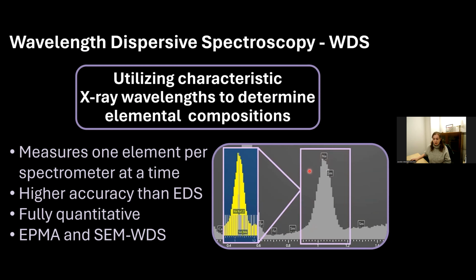So this is from a standards plot that I was analysing back in Plymouth, where we had the sodium peak, but also the software was telling me there's a lot of samarium in here. It wasn't a particularly good standard. There was a good chance at that point that there actually could have been some samarium in there.